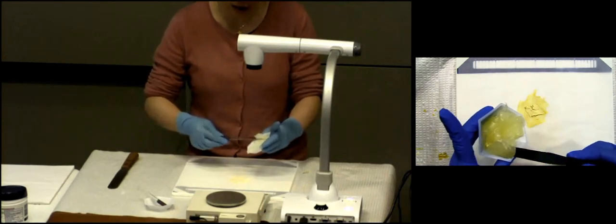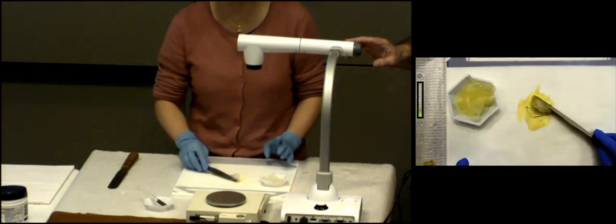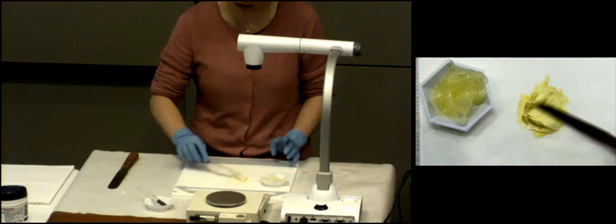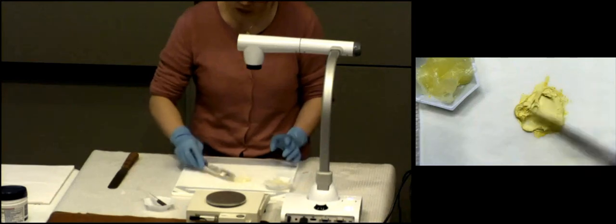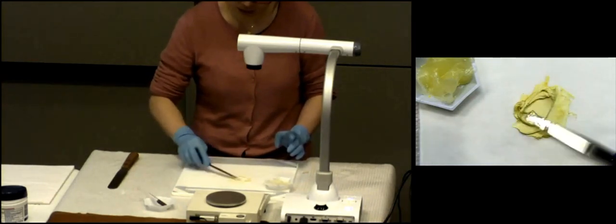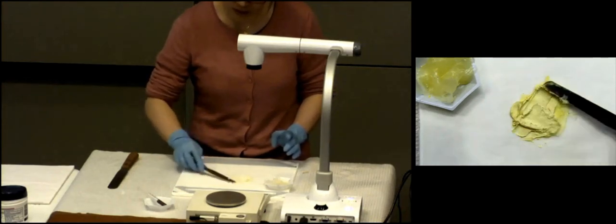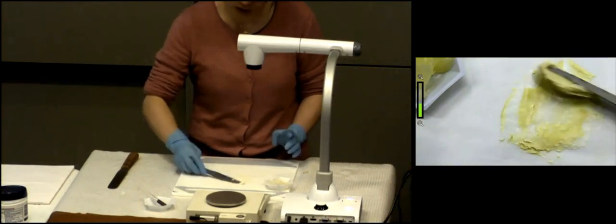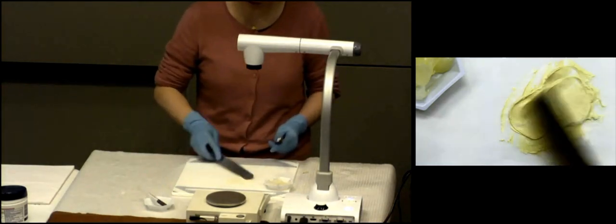All right, so this is the time I'm going to mix my levigated chemical here with my base. I'm going to add roughly a 1-to-1 ratio. What is the term you need to remember for 1-to-1 ratio? Excellent. You haven't forgotten about that yet. Okay, so I'm using my small spatula to mix. And it seems fine for right now, because with the amount of base plus drug I have, it looks like a small spatula is working okay. All right, but your larger spatula will probably work even better.